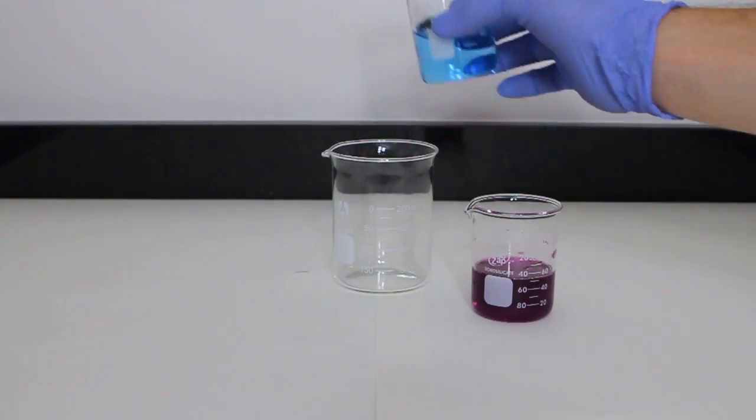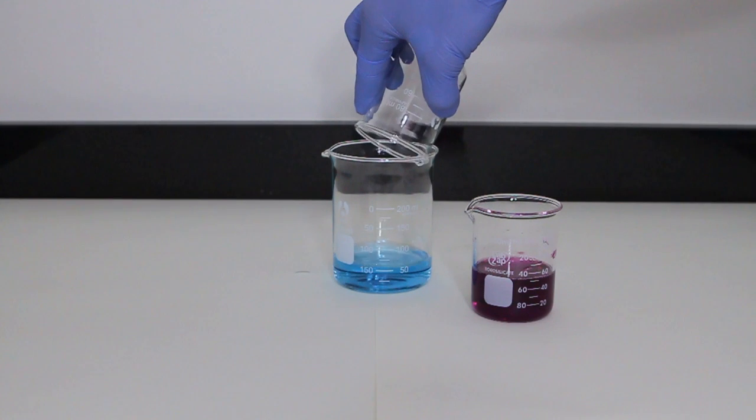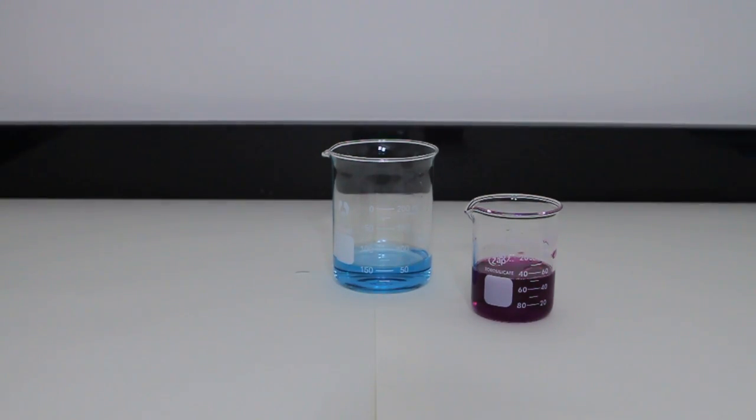Moving on to the second color test, this time I use the purple highlighter. With that solution prepared, I work through the same steps of pouring the luminol and turning out the lights. When combined, the light produces a very hot pink, and then very quickly it transforms to a mellow purple, and then back to the base blue. I'm not exactly sure why it did this, yet it is definitely one of the coolest tests done so far.